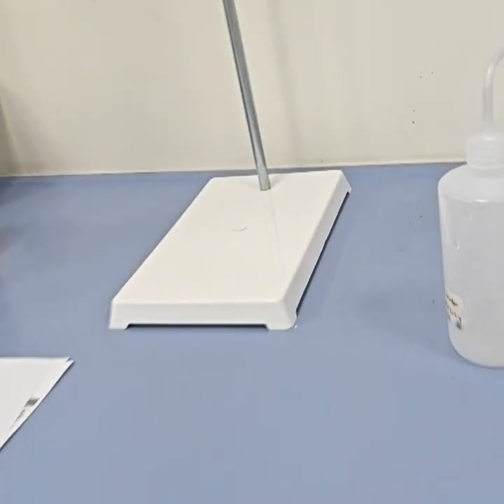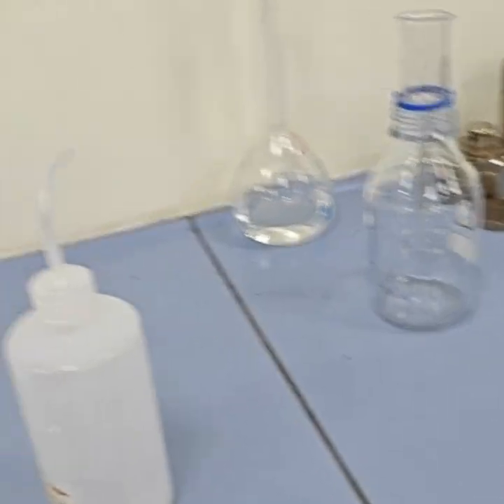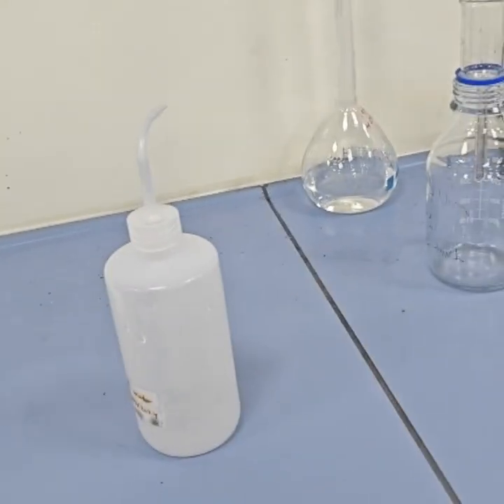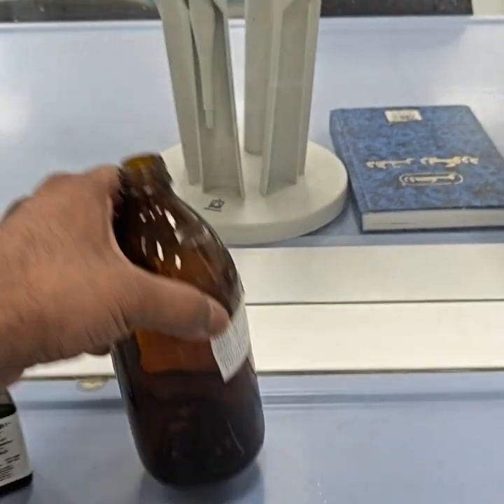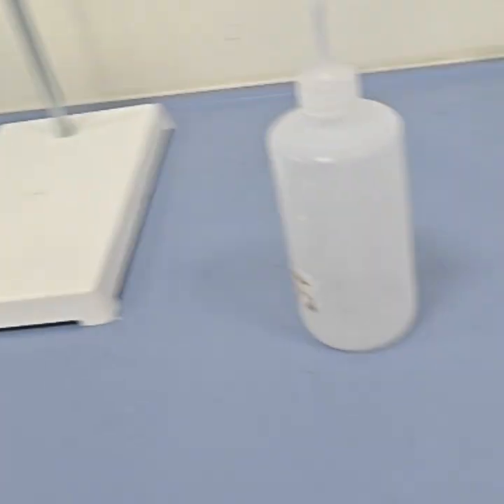Okay, in order to avoid any contamination, we have to acid wash, could be using 0.1 molar hydrochloric acid or 0.1 molar nitric acid. For phenols, amber glass bottles. Okay, like these, you can use these kinds of bottles, so there is no decay or degradation.